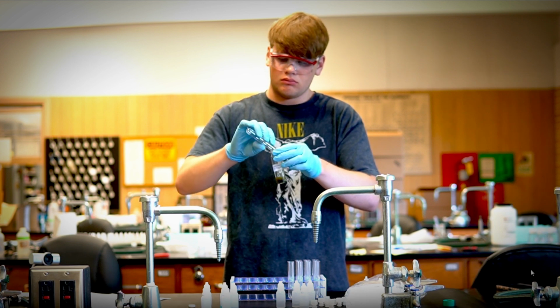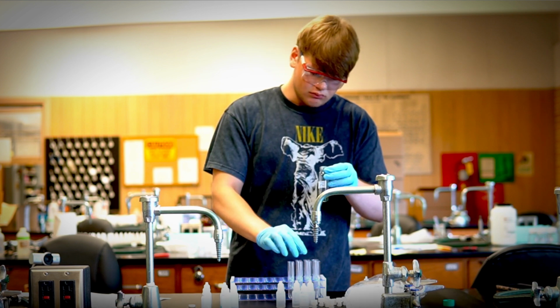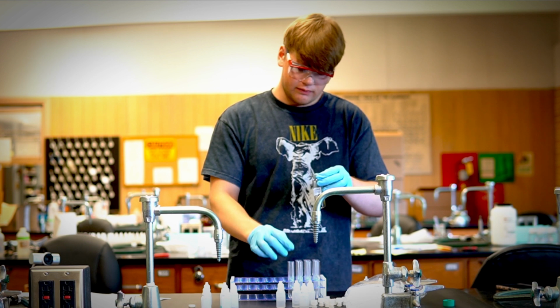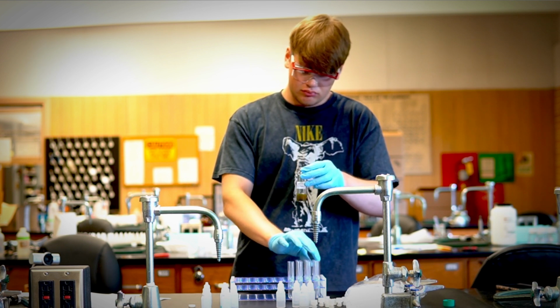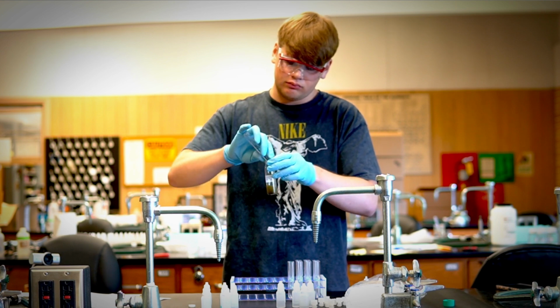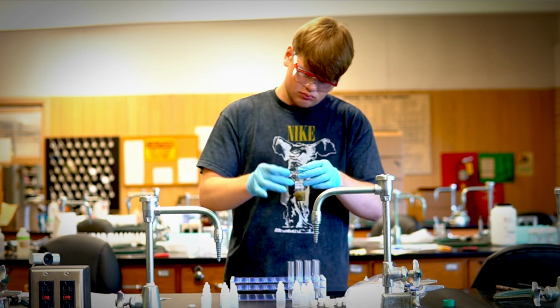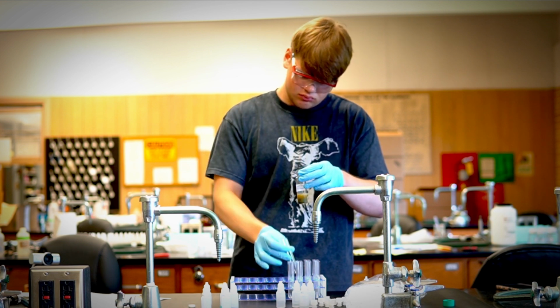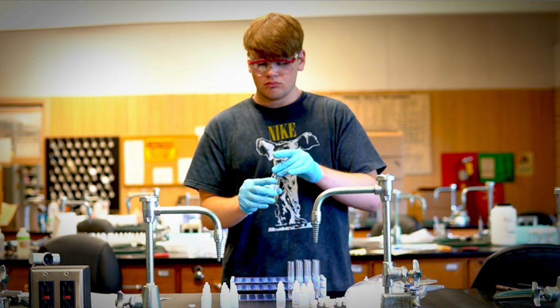But after you have gotten rid of all of the waste, make sure that you wash your test tubes. You can wash them in the sink now. You can close them. You can put them back in your box, or just keep them drying on your rack. And after that, you should be good to go. You should be ready to go back to your computer and finish up your lab.